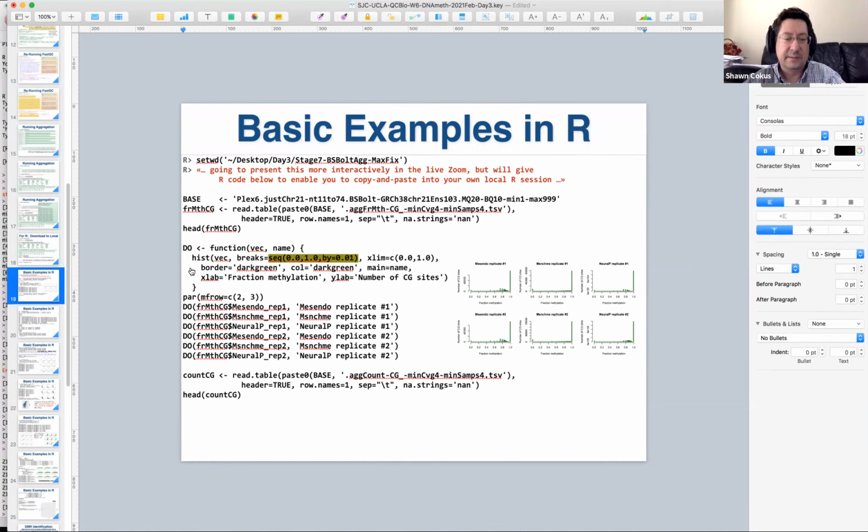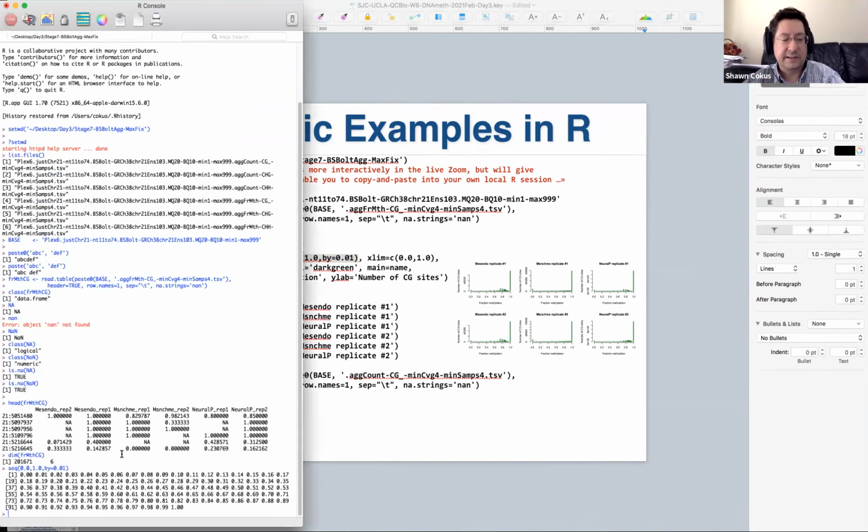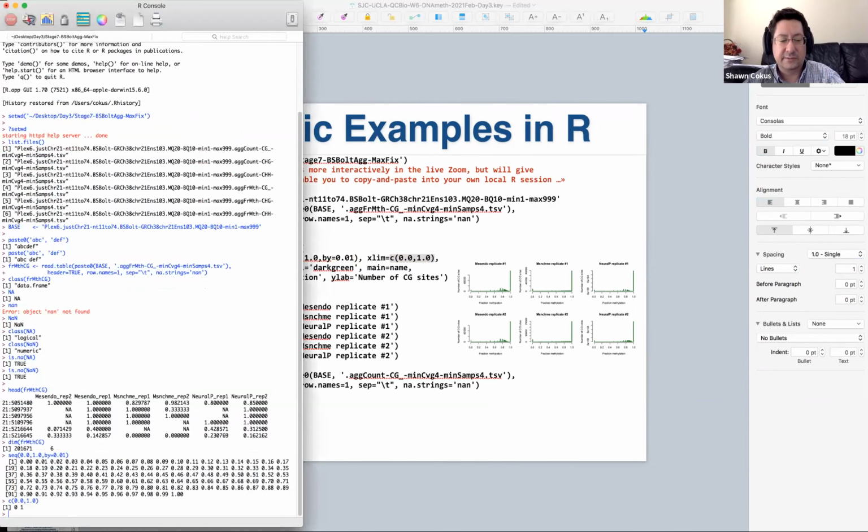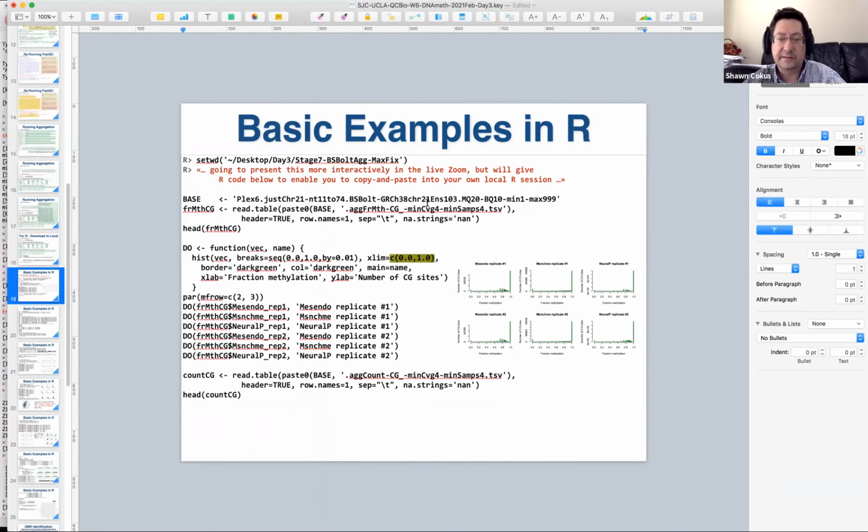So that seq just generates that list, from, to, step. That's the way seq goes. It's a very commonly used thing in R. And the c parentheses stuff is how you build lists in R, right? So that c(0,1) is really just a list with 2 entries, 0 and 1. That's basically how you give a pair, or a tuple, to something. That's very common in R too.